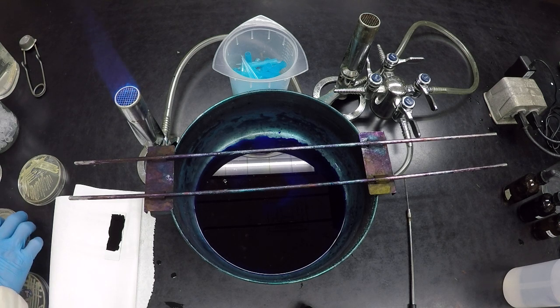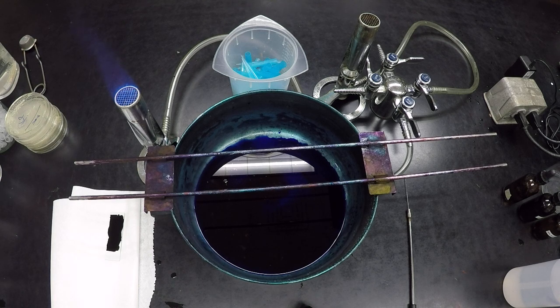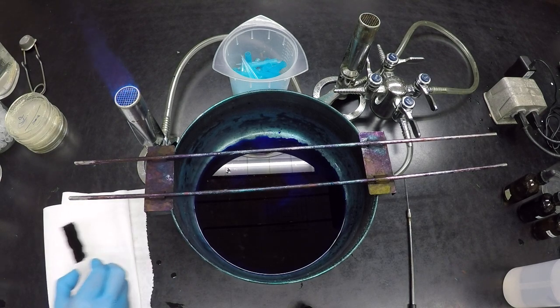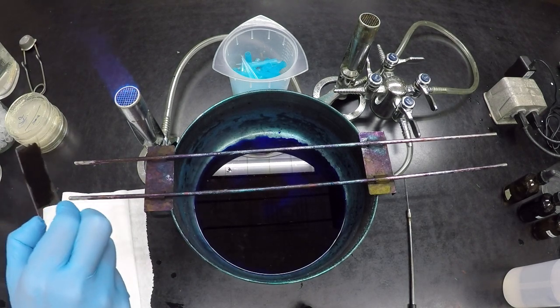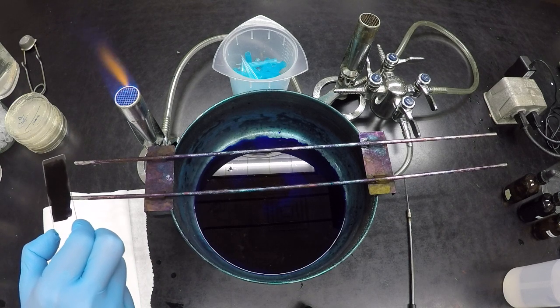Now remember, most of our smears, we end up heat fixing the slides or the smears, which ends up killing the cells. But for the capsule stain, we can't do that, right? Because the heat is going to essentially melt the sugars of the capsule, and it's going to shrink it. Right? So that's why that slide that I used to push is going to have live bacteria on it. So we can't just put it down on the table because it's a biohazard. And also, you got to watch out for this, right? Because the bacteria here are living. So again, just be very careful with how you do this.